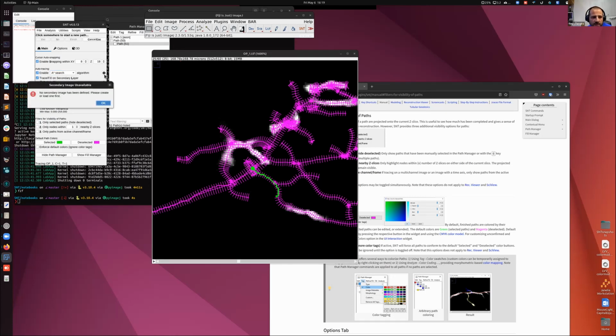And basically the parameter, I'll explain in a second what that error message was. And then there are a couple of things that you can do to optimize that search between the start and end point. You can specify the data structure, and what that would mean is that you can either be fast or lightweight. Lightweight in the sense you can use less RAM. So if you have a big image, you probably want to use map, and you can read more about this in the documentation.